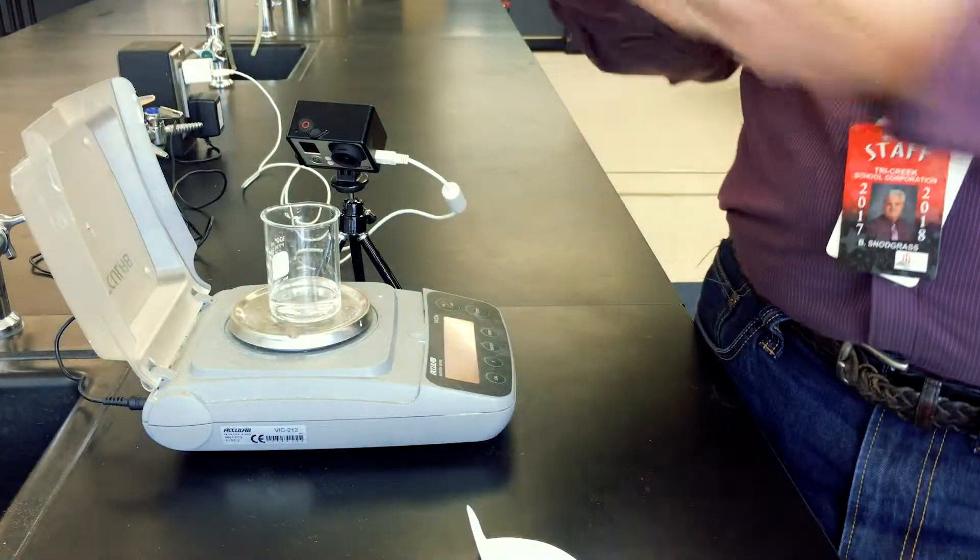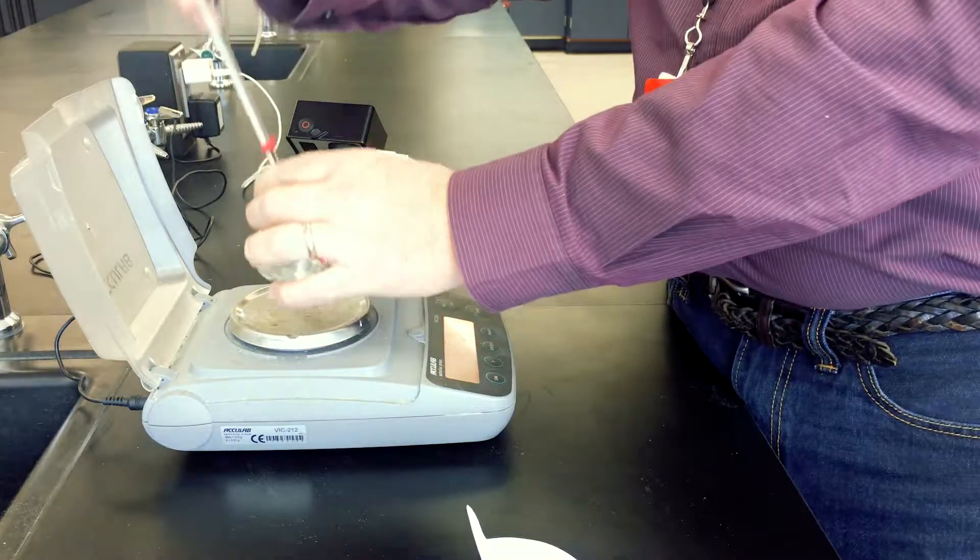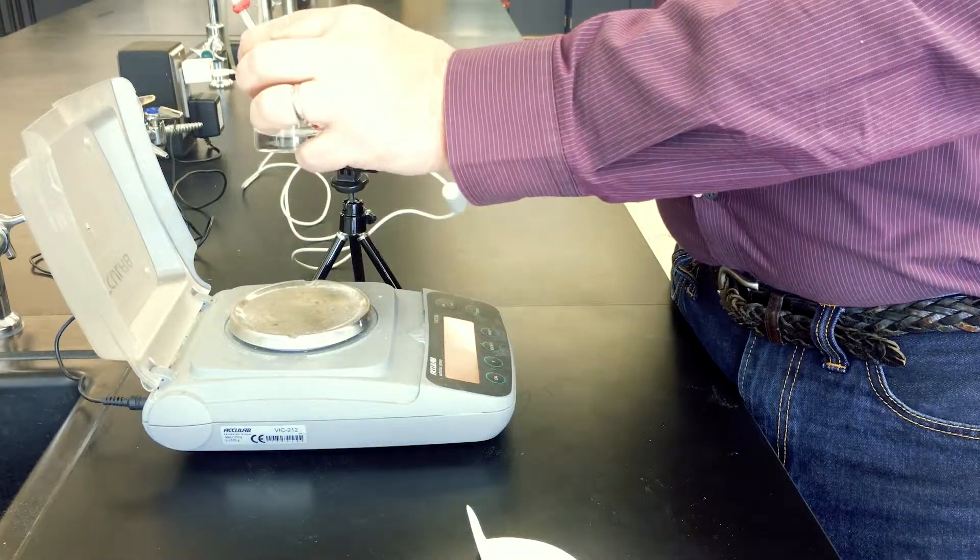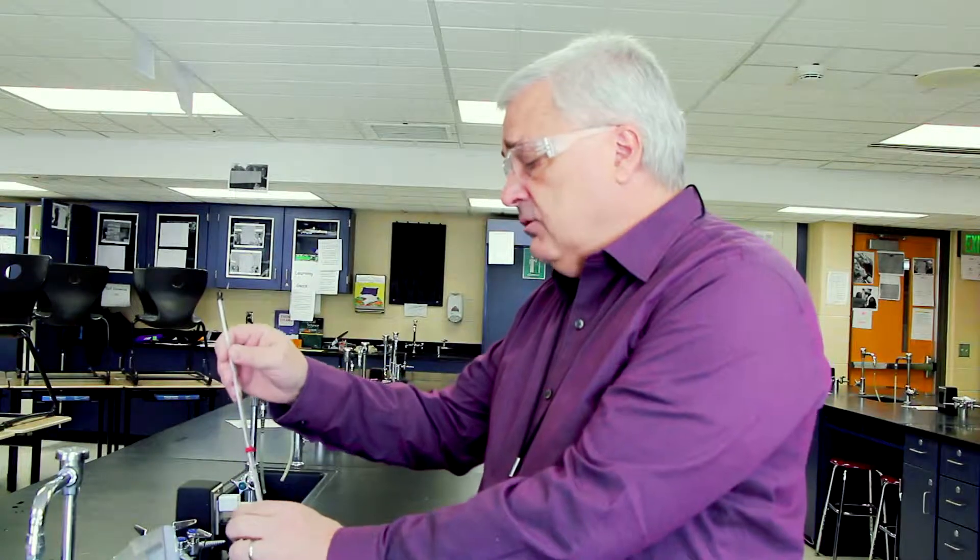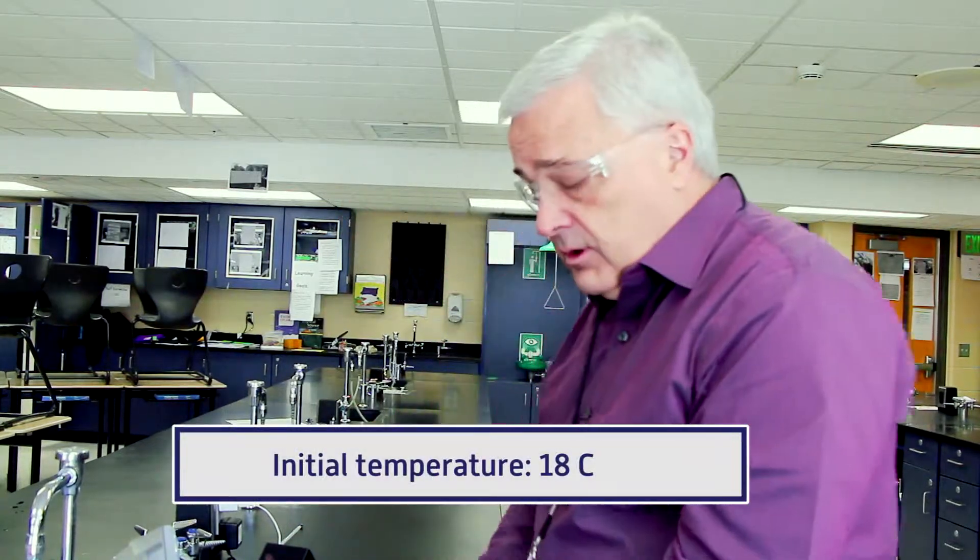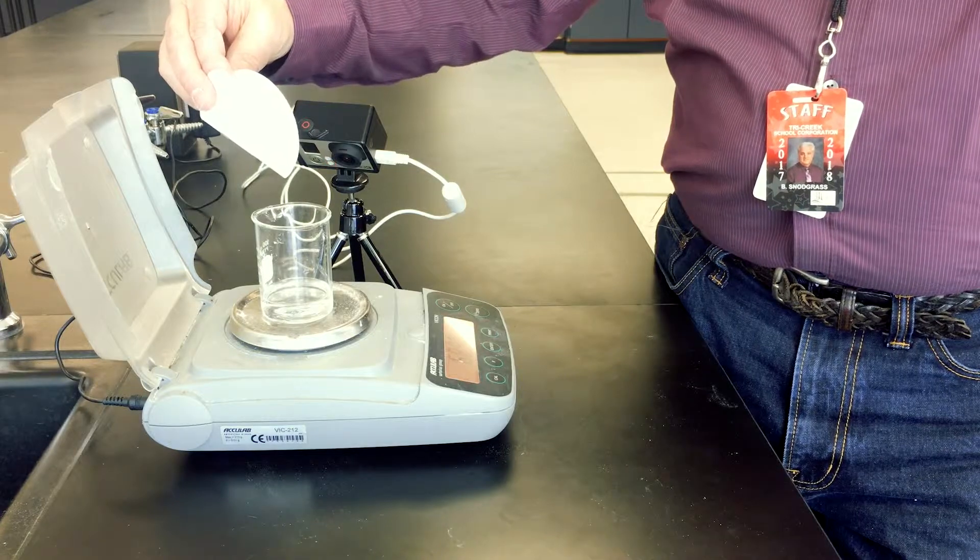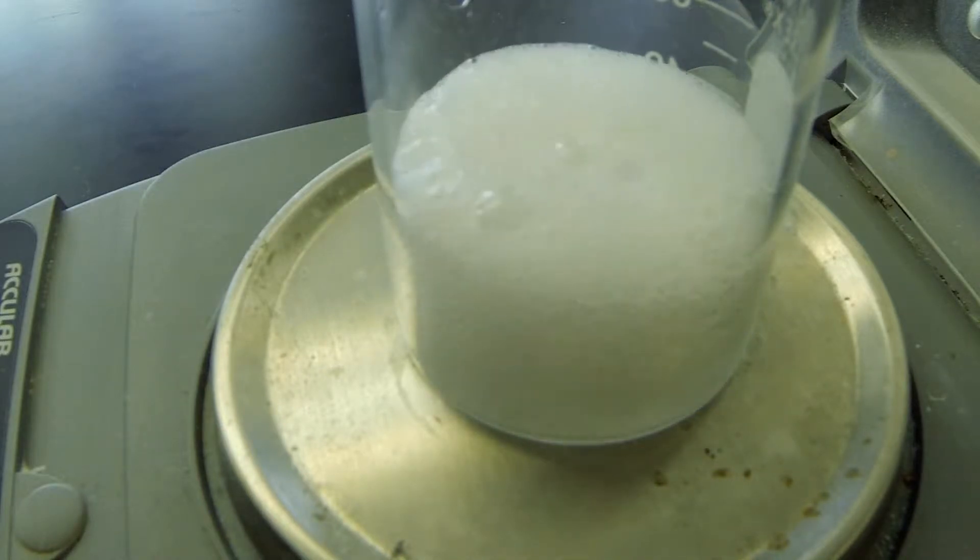When the reaction takes place, we're going to produce carbon dioxide, which is going to escape. As a side thing, we're going to take the initial temperature of the liquid, and it comes to 18 degrees Celsius today. So we're beginning with 18 degrees as our beginning temperature. Now we're just using the folded filter paper to channel the sodium bicarbonate into the liquid. We're going to add that and the reaction begins to take place.